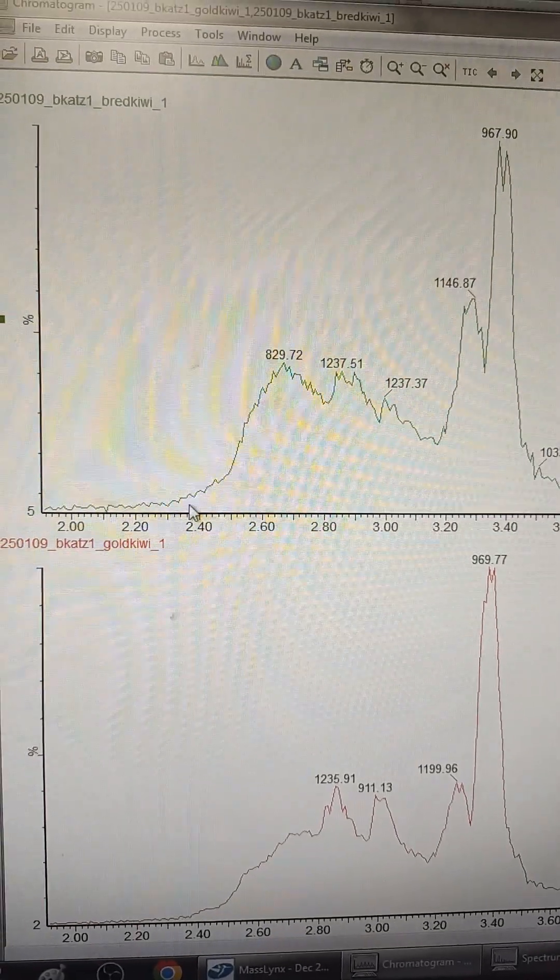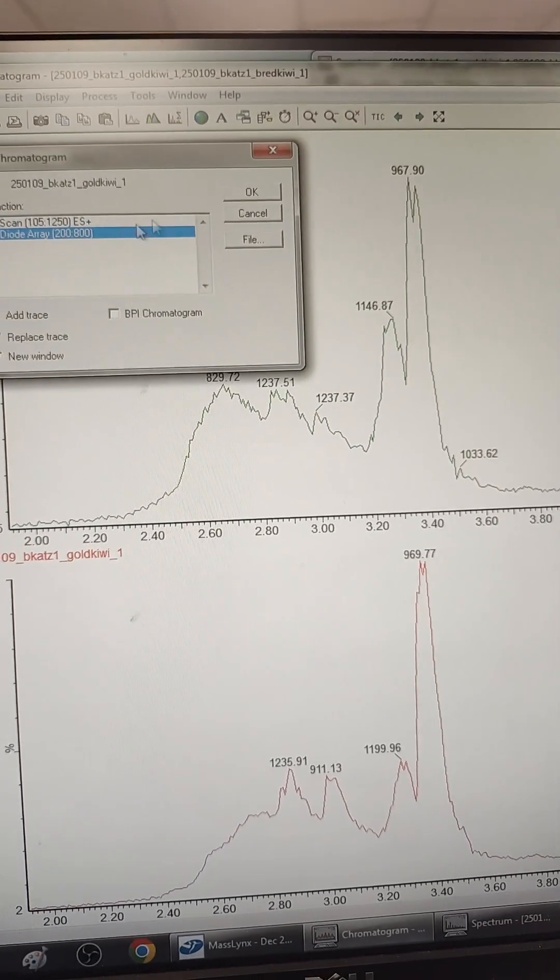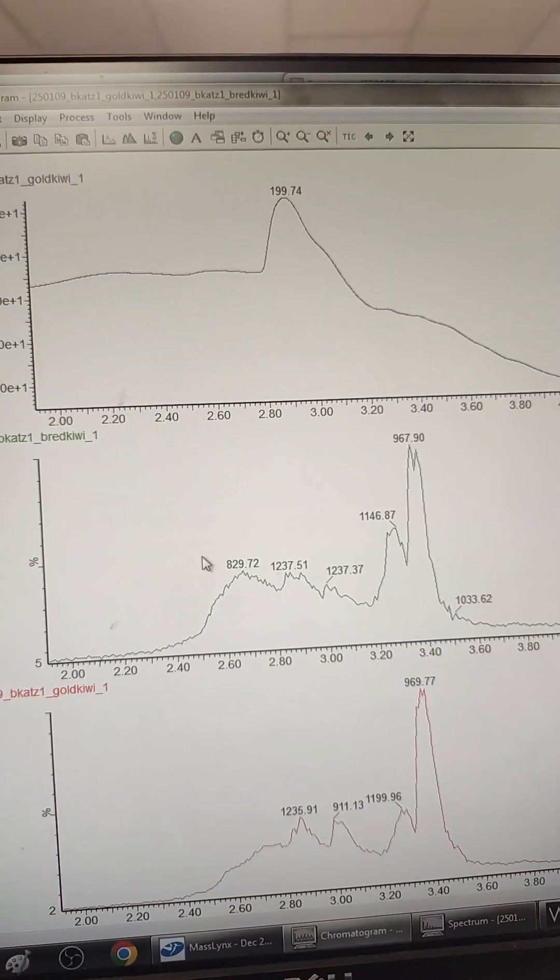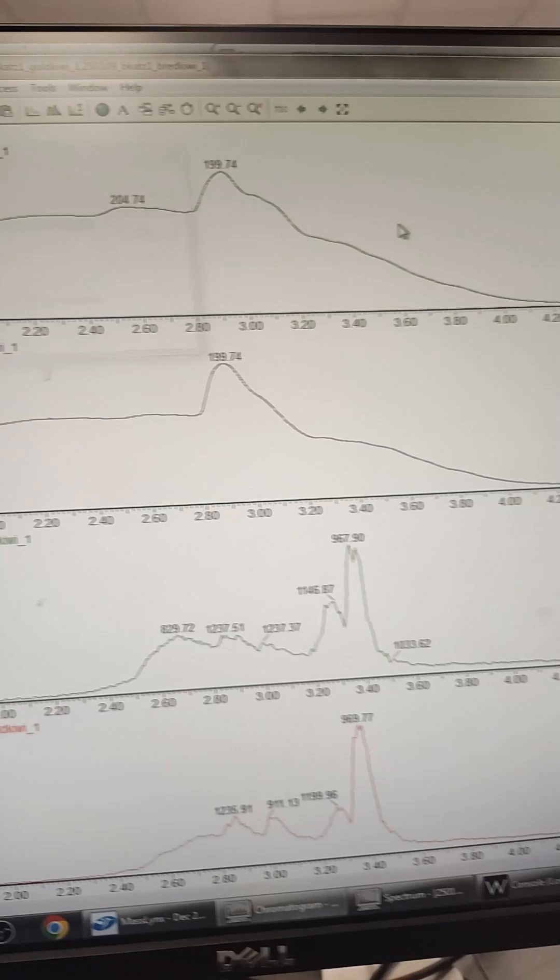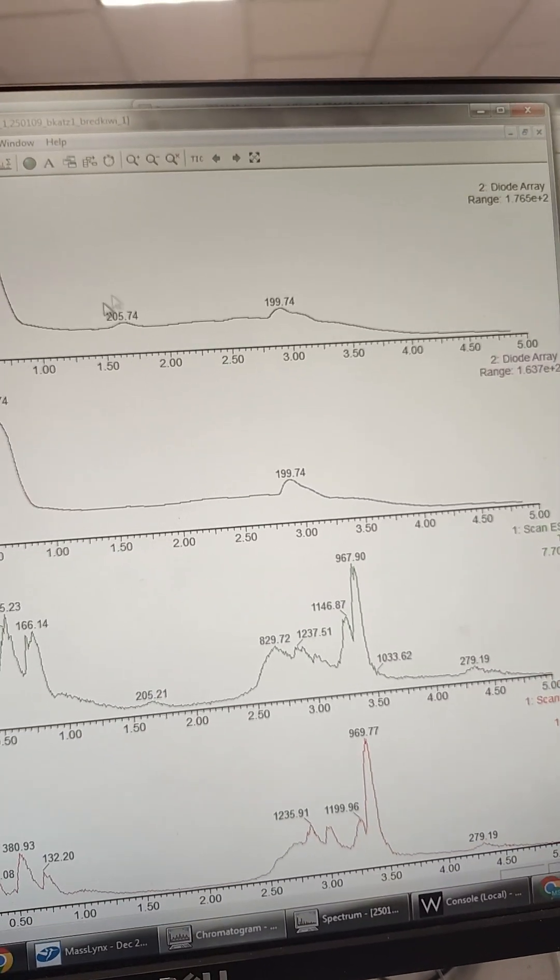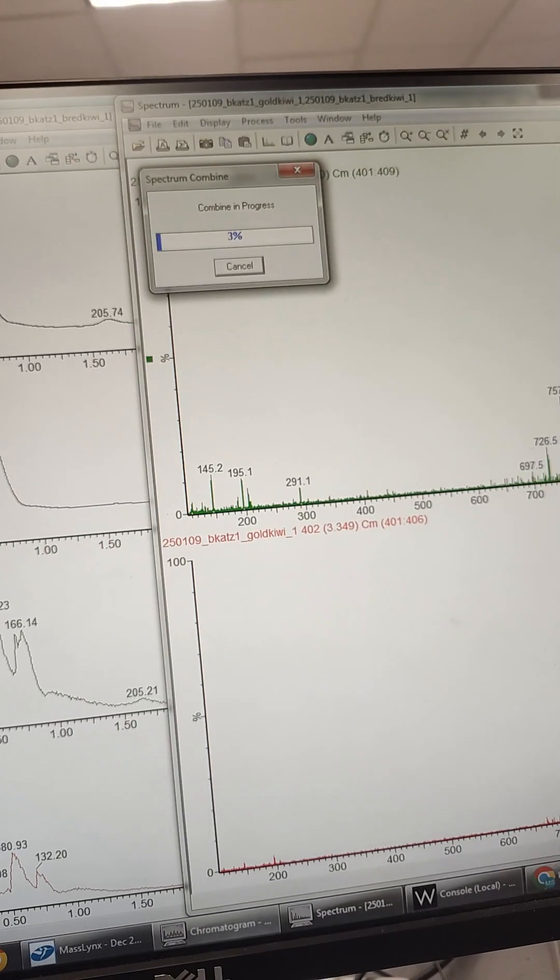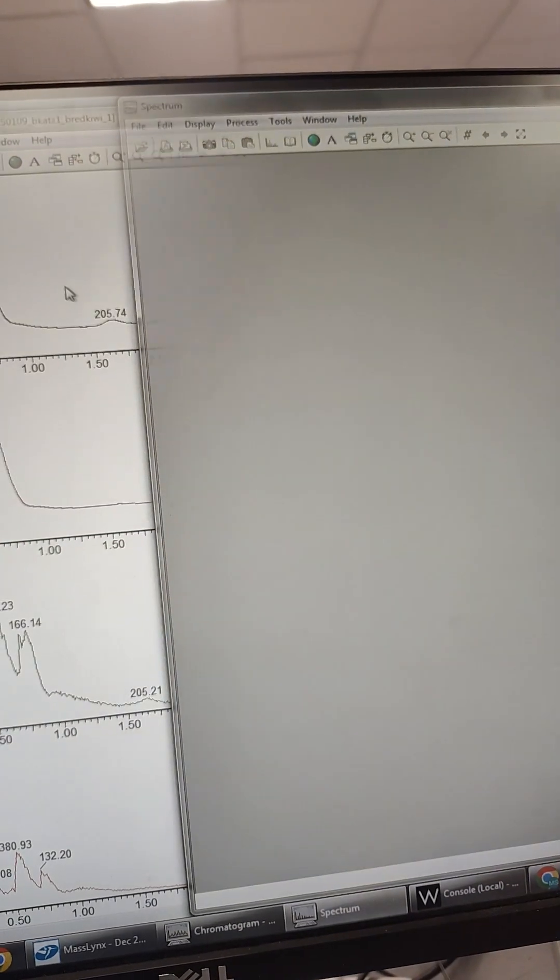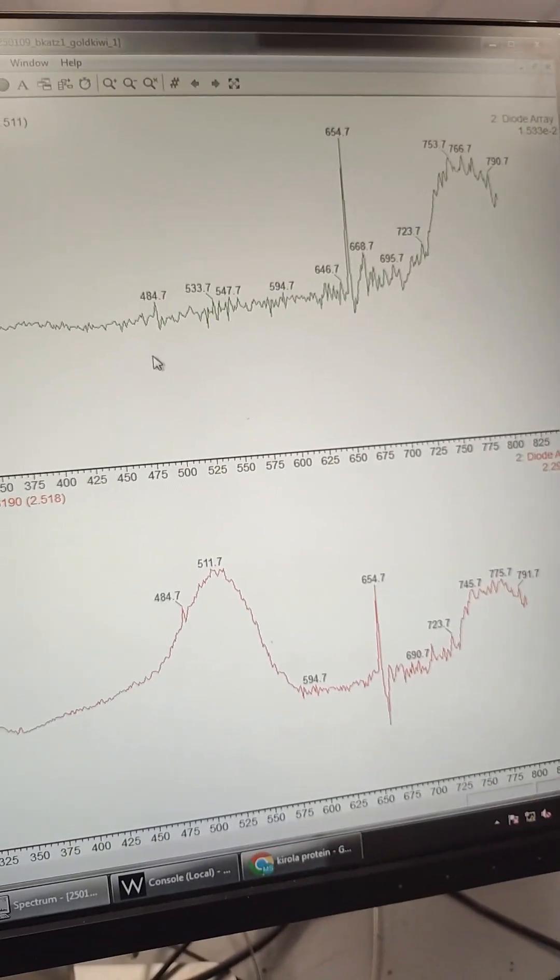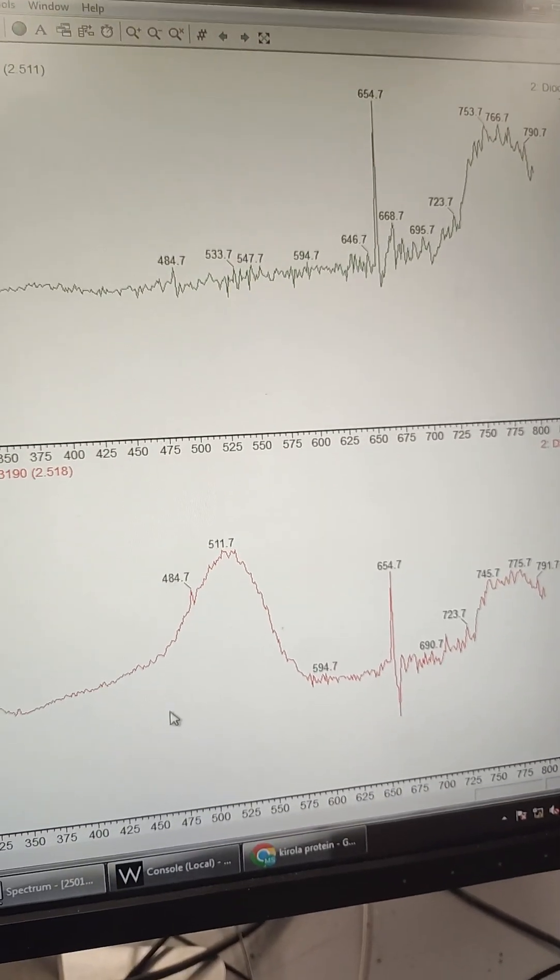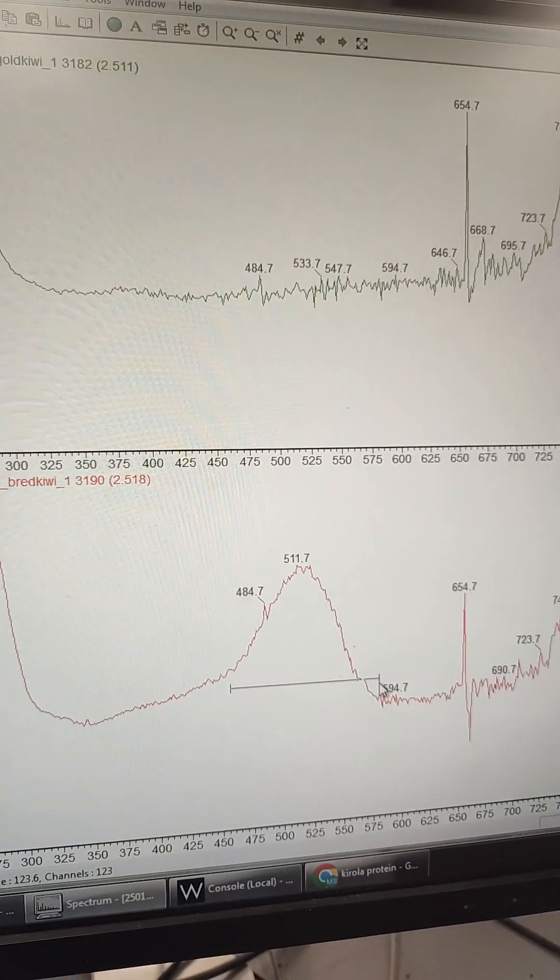The major difference we're looking for is actually in the color. What is the red pigment? So you can open up the diode array channel for both samples. And they look pretty similar. Again, we have differences out here. And the color we're looking for is something in the red. Something in the absorbance of 500. There you go. Somewhere in that 400 to 500 to 600 nanometer range.